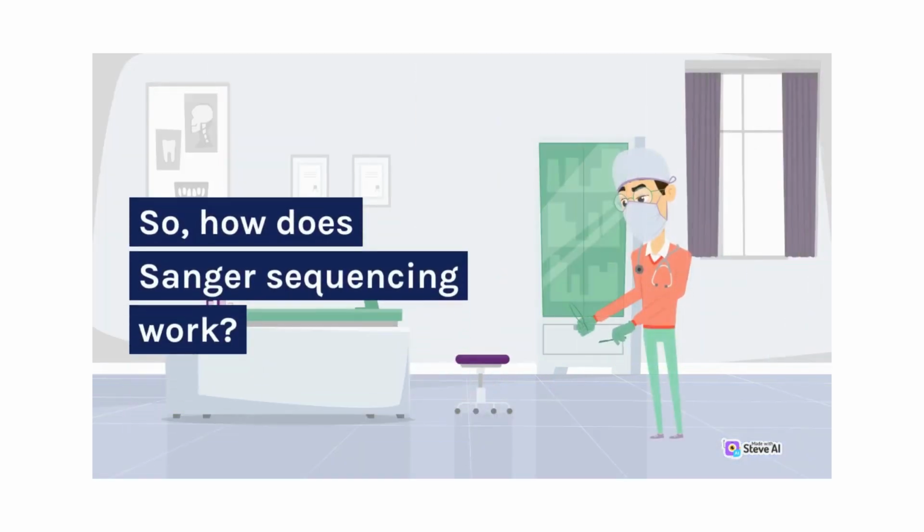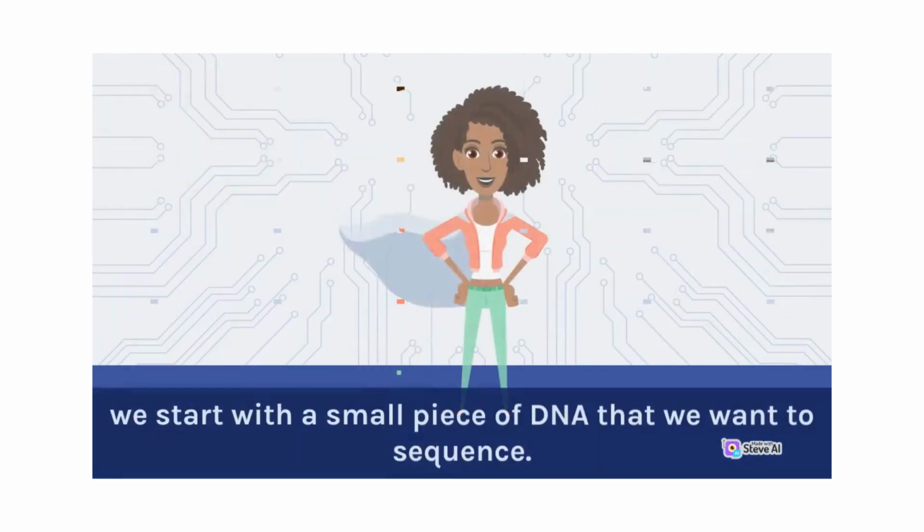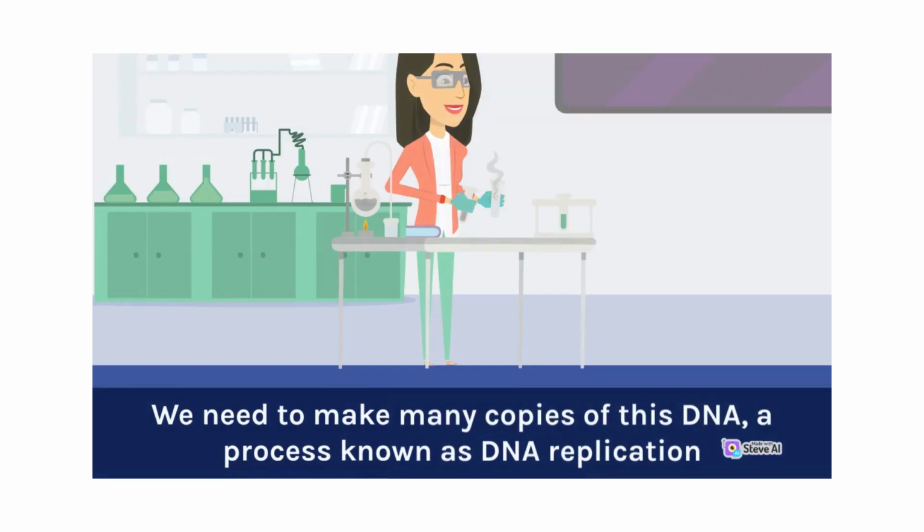So, how does Sanger sequencing work? It's a multi-step process, but I'll break it down into the key components. We start with a small piece of DNA that we want to sequence. We need to make many copies of this DNA, a process known as DNA replication.